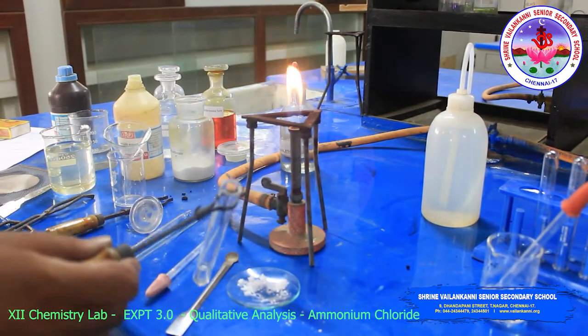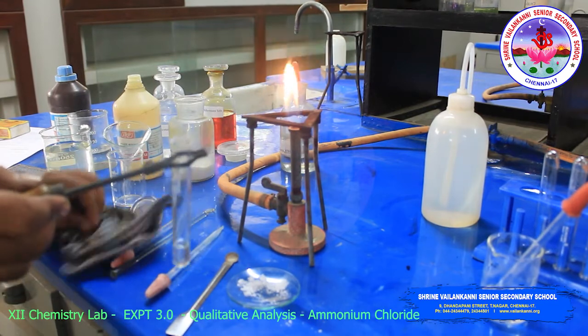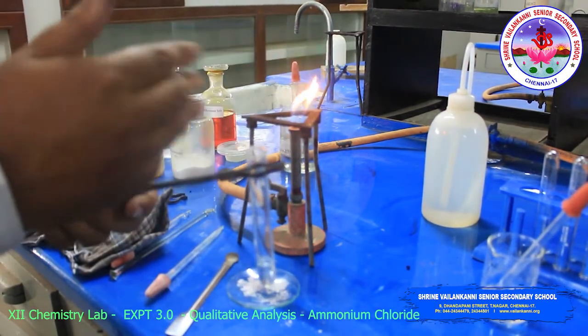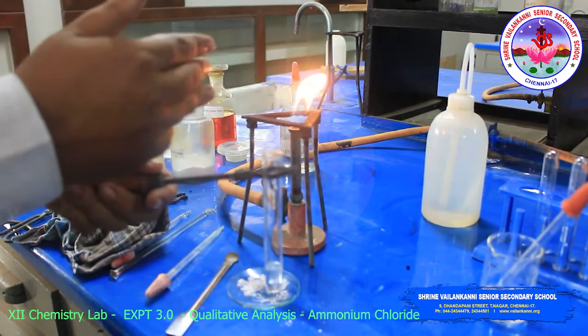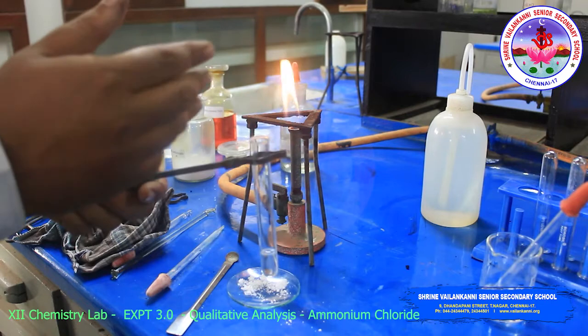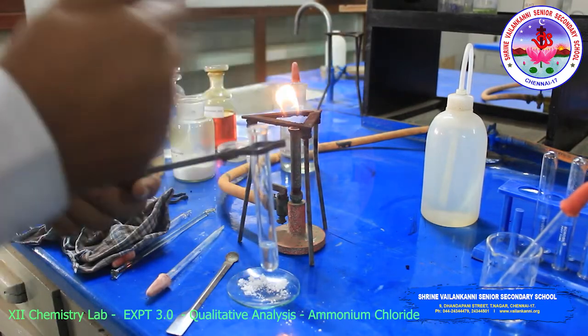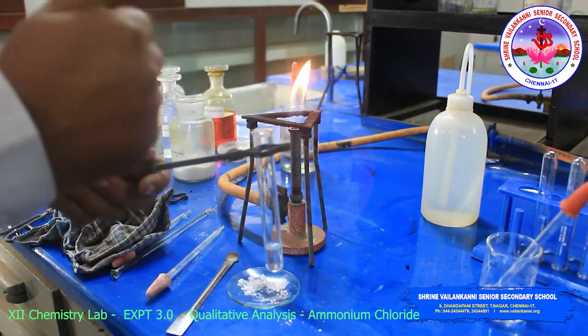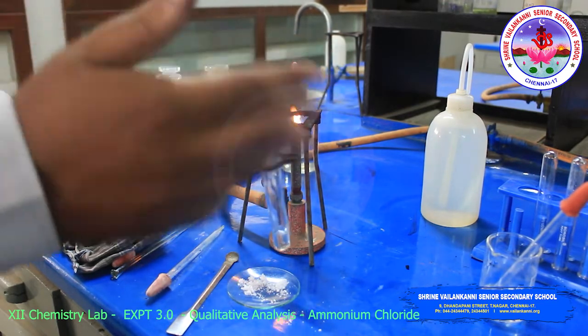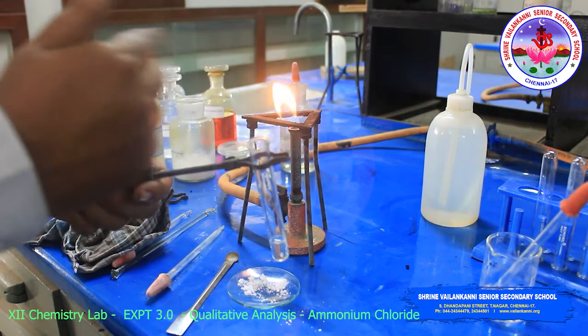So when you smell the substance or any chemicals, just do like this. Waft the vapors toward you with your hand like this. Do not directly inhale the substance, because some substances are very intense. That's why you have to do like this, then only smell it.